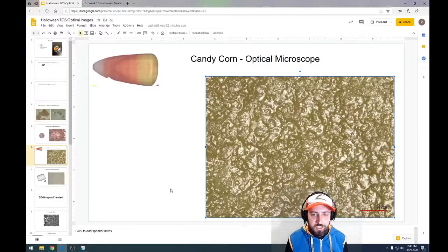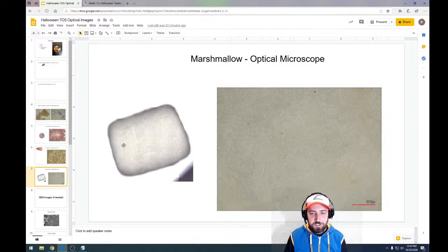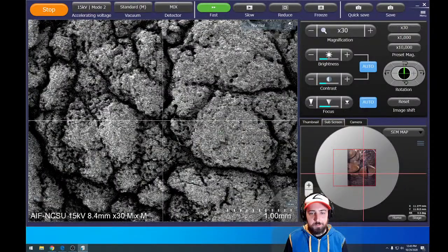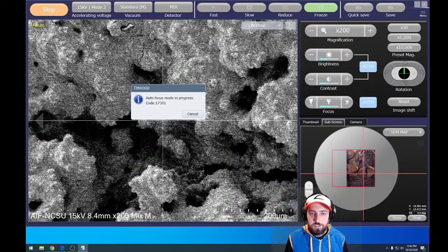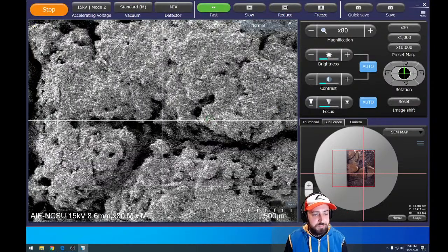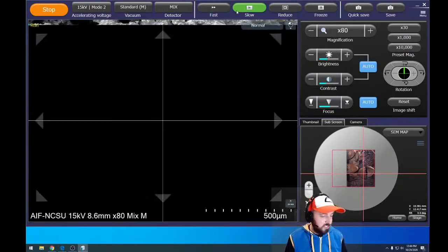Now let's look at it in the optical microscope, even though there's not much to see with the optical microscope. This one got a little bit dirty. There's some stuff on it from the glass slide that I put it on. I did not use a brand new glass slide for looking at it. But this is just the image in the optical microscope, and it's not too revealing to me. I mean, it's white and it looks fluffy. Let's zoom in and then refocus. And while it's focusing, I'll back out to about the same magnification that we were at for the sugar, and then let's start scanning slowly.